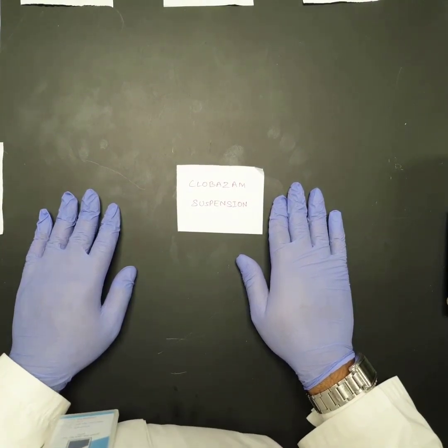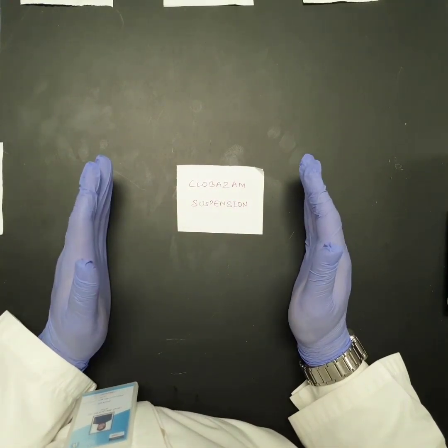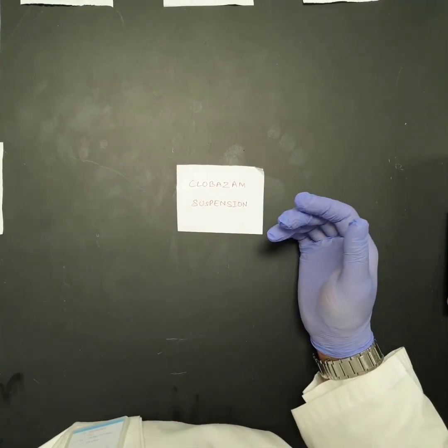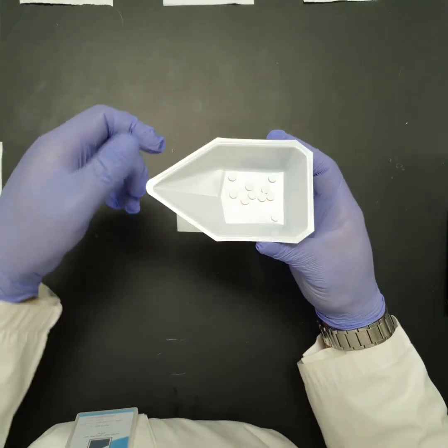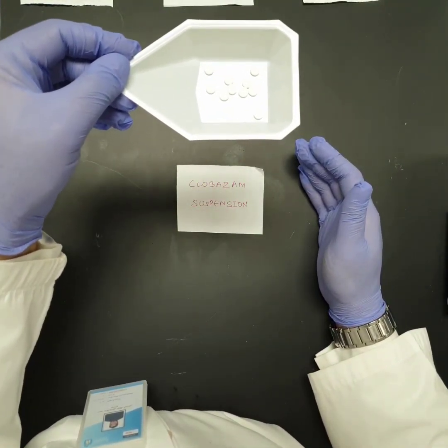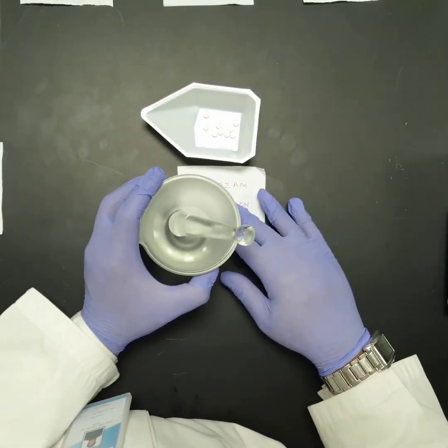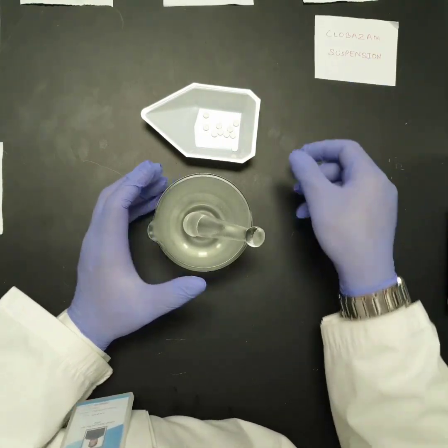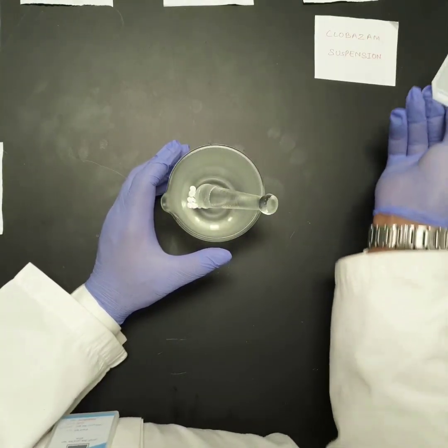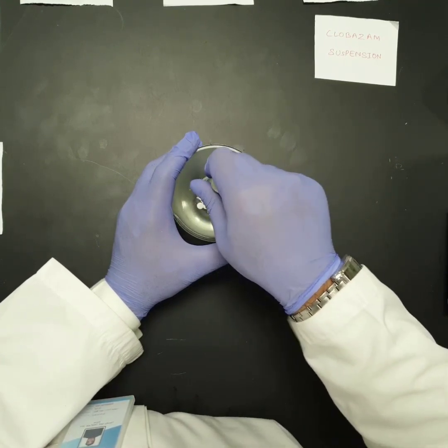Assalamu alaikum warahmatullahi wabarakatuh. So this is the demonstration for clobazam suspension. I am going to demonstrate and illustrate how to prepare clobazam suspension out of these clobazam tablets. So first of all, according to our prescription, we are going to need 10 tablets, which I have kept ready, and then I am going to take a glass mortar and pestle, and transfer these 10 tablets of clobazam into this glass mortar, and I am going to grind and crush the tablets with this pestle.